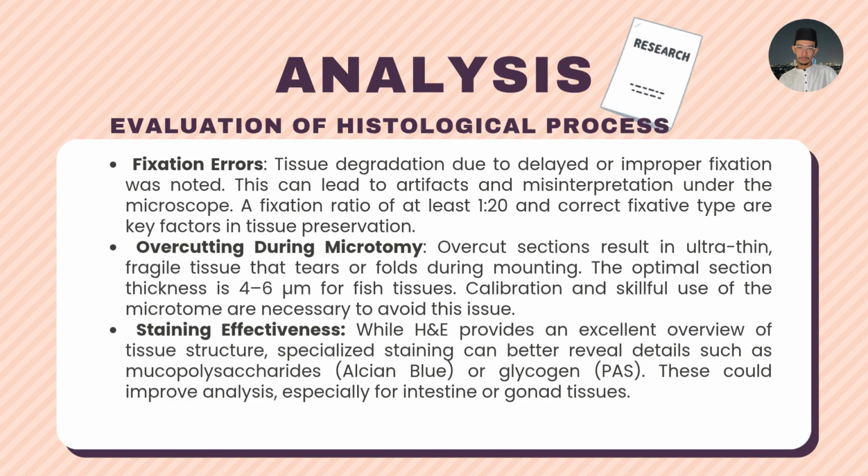The final one is staining effectiveness. While H&E provides an excellent overview of tissue structure, specialized staining can better reveal details such as mucopolysaccharides or glycogen. This could improve analysis, especially for intestine or gonad tissue.